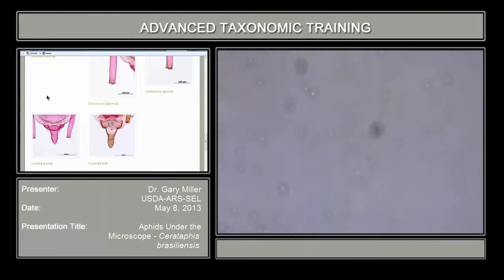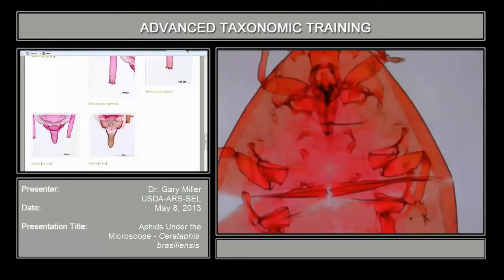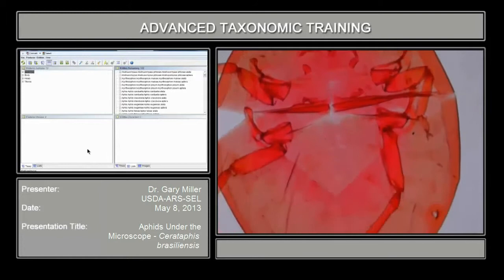If you have your specimen of Cerataphis, we're going to take one without wings — an aptera. So we have our specimen in the field right now. We're going to try the Lucid key again.